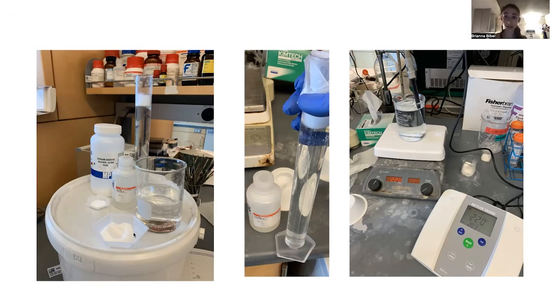So start by dissolving the glycine. Get about three quarters of the way with your liquid, and if you're adding the Tween separately in a larger volume, make sure you leave plenty of room for that as well. Dissolve the glycine first so you can see it dissolve and you don't have all those bubbles. I didn't really have much problem with bubbling because I was careful. So the glycine, then the SDS, then I poured in the Tween, adjusted the pH with hydrochloric acid, adjusted the final volume, and voila, I had my stripping buffer.